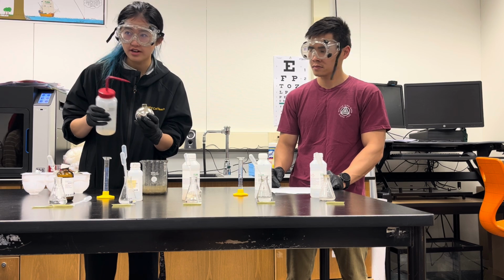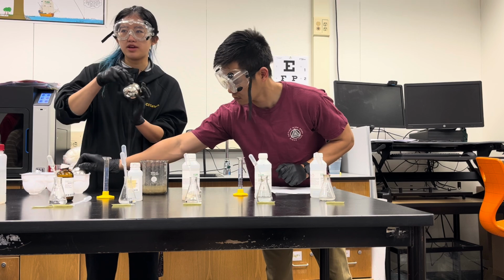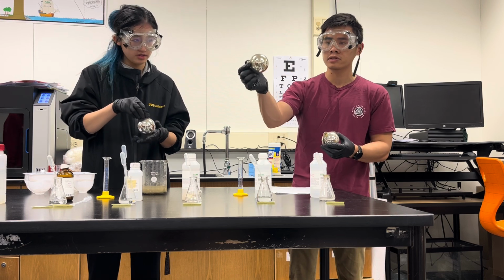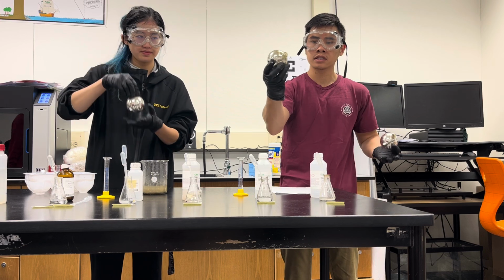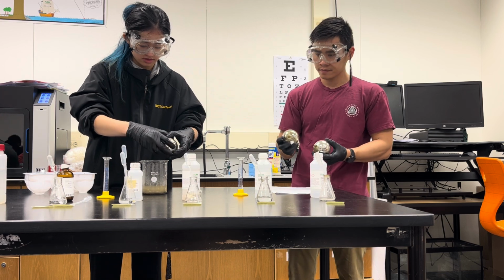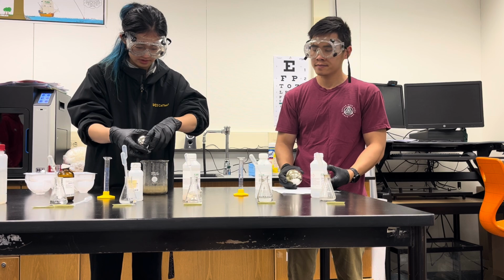So what will happen? Well, it might degrade the silver. It might look like it's chipping or streaking, kind of like these ones. In the first trial that we did, we redid it so it doesn't look as bad, but you can see that the silver ornament isn't as clean. That streaking happened because of the reaction between the ions in regular water that we use. Oh, I'm just gonna coat all the sides. Well, that's cool. It looks so silvery.